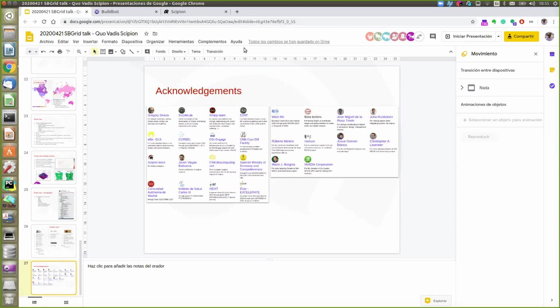Yeah, I would say, obviously there will be Relion 3.1, which will not be released in Scipion 2.0. All the Xmipp stuff will not be released in Scipion 2.0. There are bug fixes and usability improvements. So if you're okay with Scipion 2.0, you're happy, you're in a critical step, I don't think there's a rush to install Scipion 3.0.